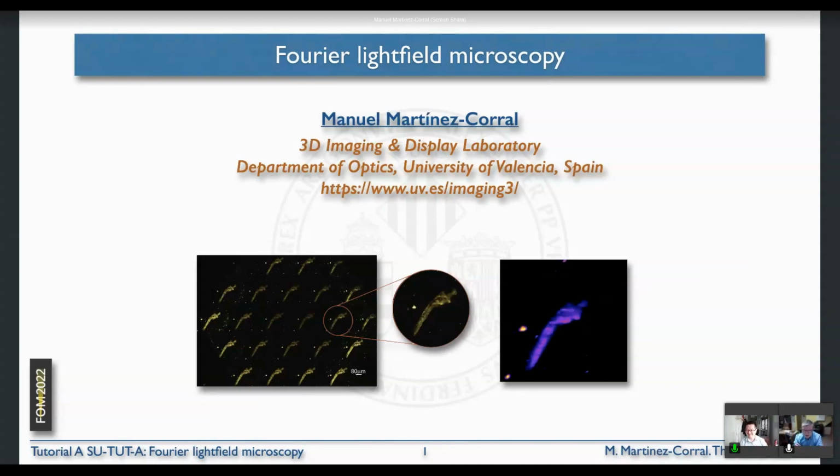Okay, thank you very much. Thank you for the presentation. I'm going to give my talk about a recently reported microscopy technique. Fourier Lightfield microscopy is a technique which is mainly aimed at producing three-dimensional images of dynamic samples or dynamic specimens. This is made at the cost of some loss in resolution. I will explain that along the next 2 hours.